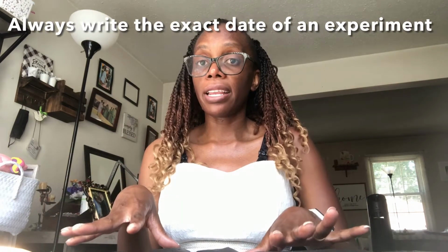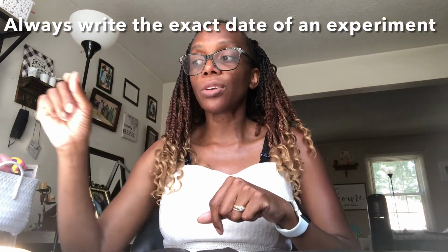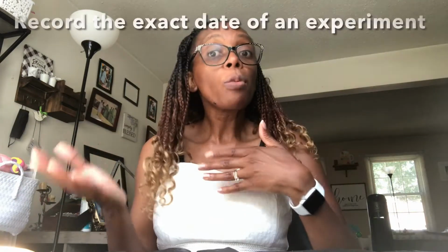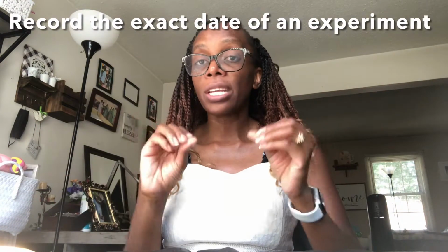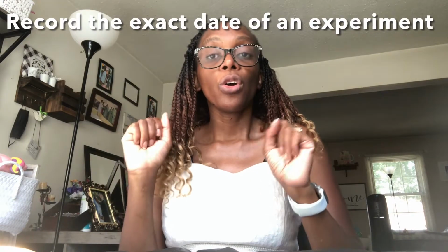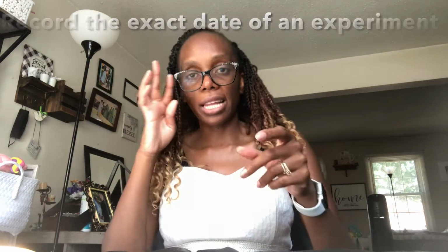That's completely fine, as long as you indicate the date, because that's really important in case your results show some discrepancy between locations. It could be because there's been a gap in when you analyzed. That's why you have your eLab notebook and your photo uploads to record your work. And remember, in science, it's very important for us to record every single thing that happens.